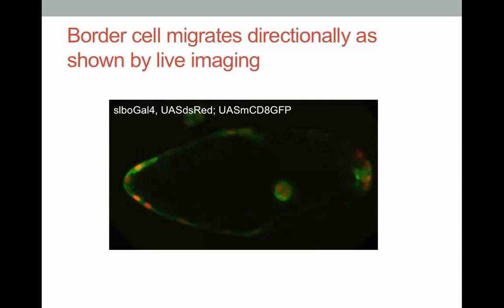But we know that for the wild type, there's still a limited range of the cluster diameter. So we try to go ahead and generate smaller clusters and also larger than usual clusters. And then with these three data sets, we try to plot this speed and radius plot.